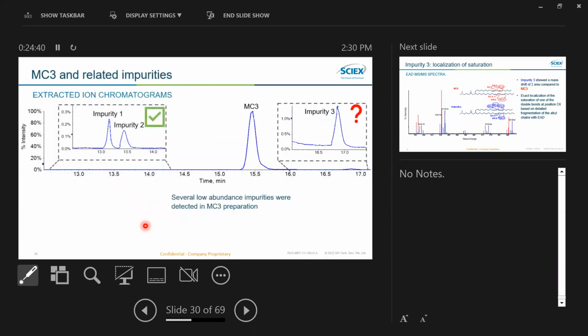So going back here, we were able to distinguish and characterize these two structures. Impurity 2 was the N-oxide species, and so this one could be the more problematic impurity that, if you're formulating these types of mRNA therapeutics, you want to keep track of.